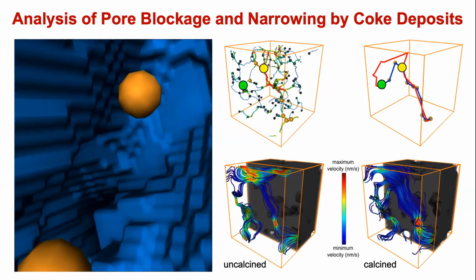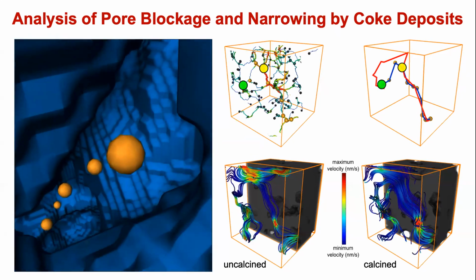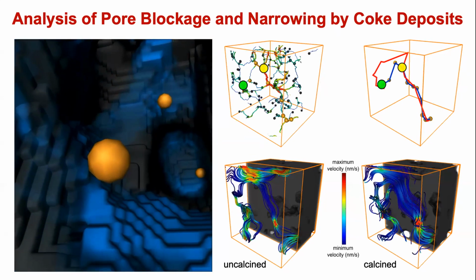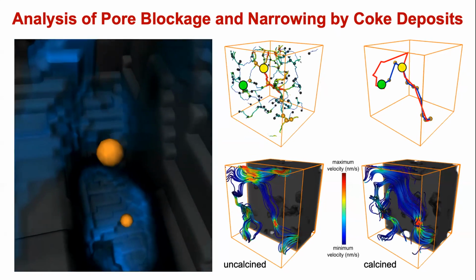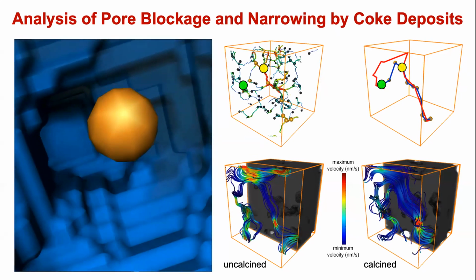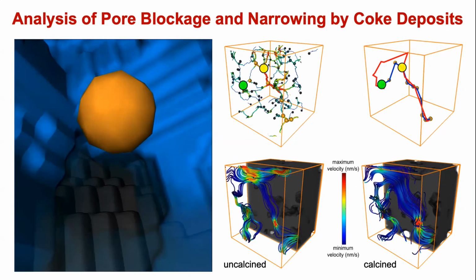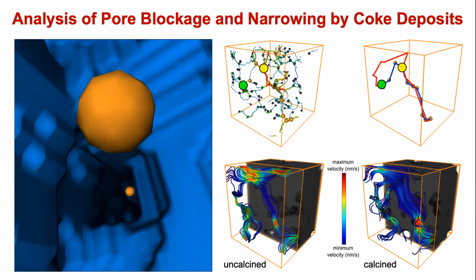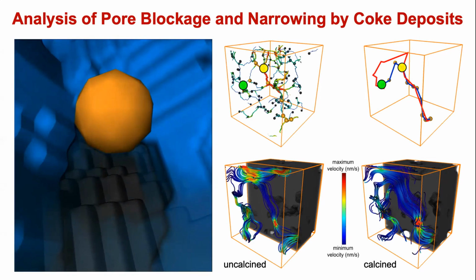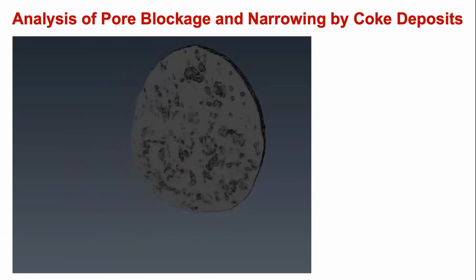Now what we did is we measured it before and after calcination. So we know where the carbon is. And here, this is where the carbon is in black. See, you know now where the carbon is. You know where the carbon is, you know where the metals are, and you can even get flowing through it, because that is what I want to show in the next, I think. I hope the movies work. Sorry, it does not work.